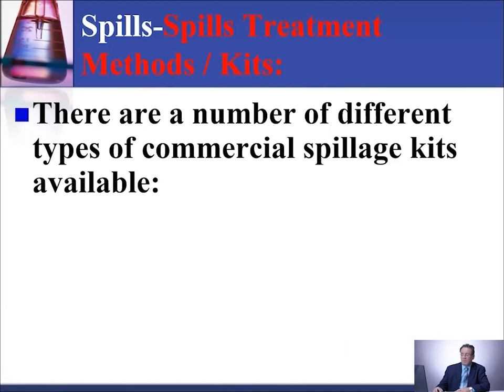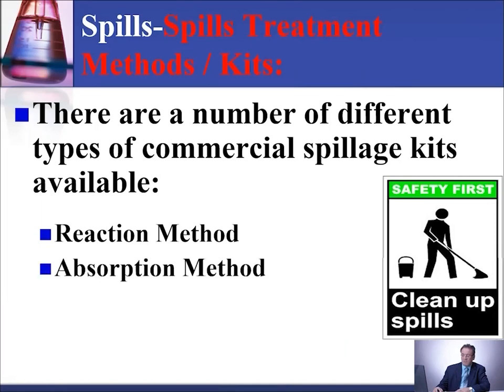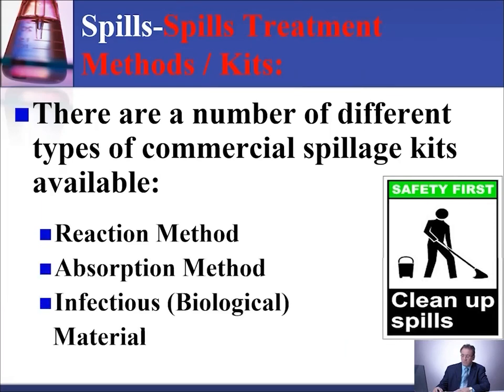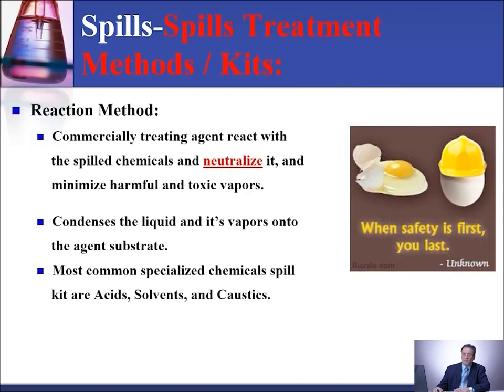There are a number of different types of commercial spill kits available. Okay, there is the reaction method, absorption method, and infectious or biological material. And we'll talk about each one of them separately.